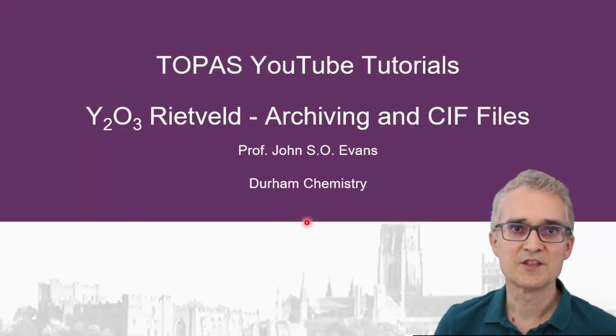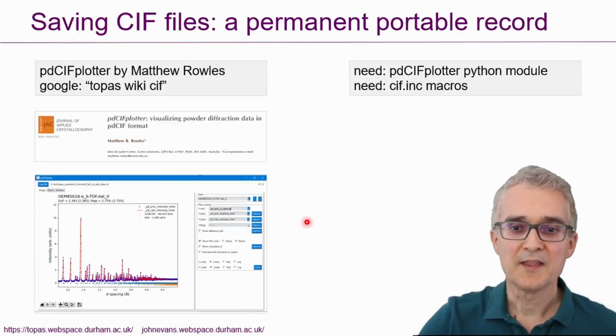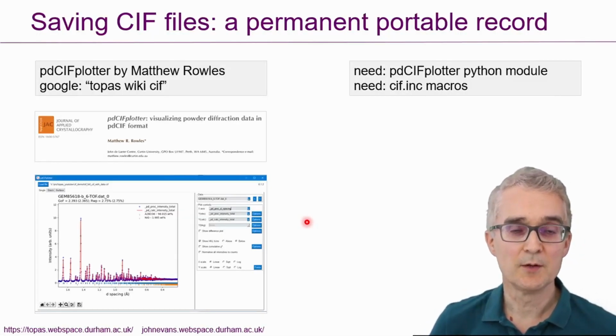Okay, so in this video, I just want to pick up on a couple of final points about the yttrium oxide Rietveld refinement. The main things are what you should do at the end of the refinement in terms of checking things and archiving your results. The take-home message, or the most important thing in this video, is on the screen here.